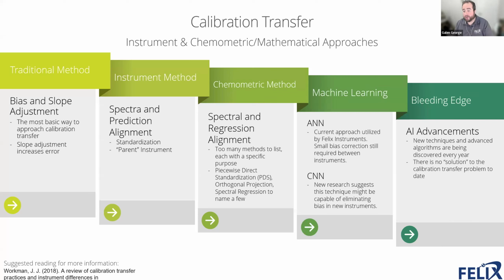Whereas the neural network learns on its own how to identify those small differences in spectra from the different spectrometers, as well as across instruments of the same type. So all of our models will include data from many F751s and many F750s so that we can hopefully encompass all the variability that we see between batches of spectrometers, essentially. And so that's where we're currently at.